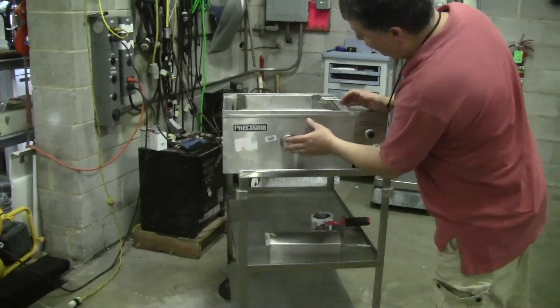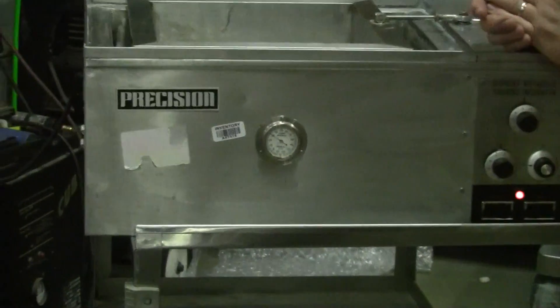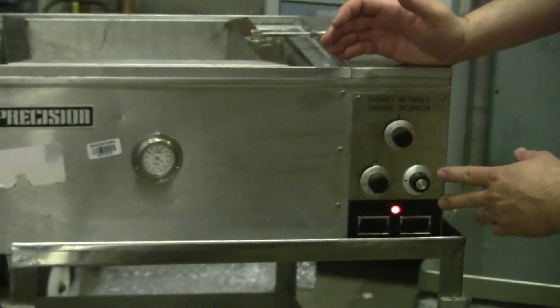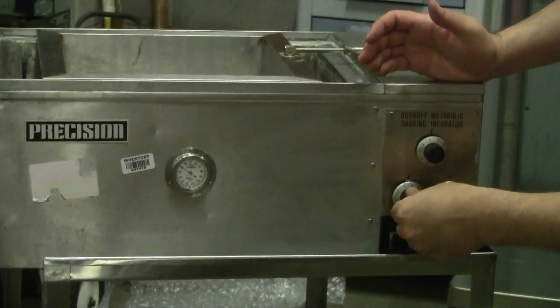There's a temperature gauge built right into it — just a simple dial with a probe. It has three levels of heating: low, medium, and high, where you can control the temperature set point.